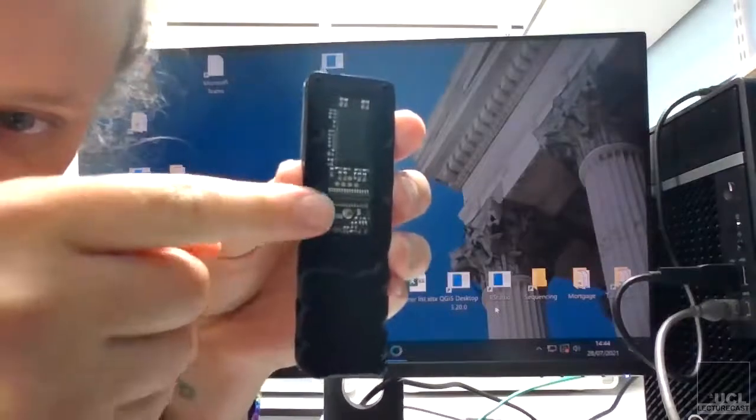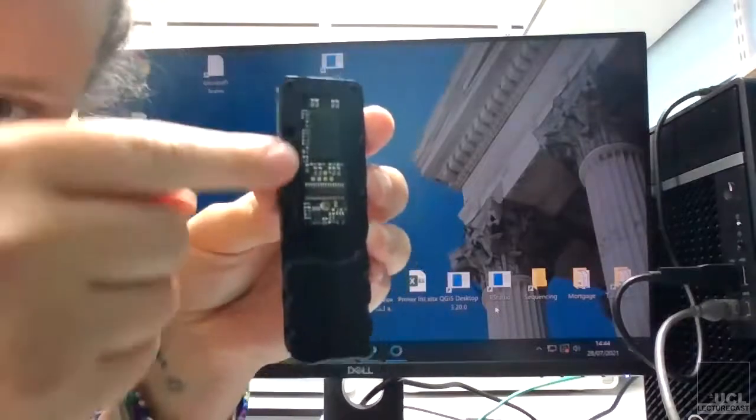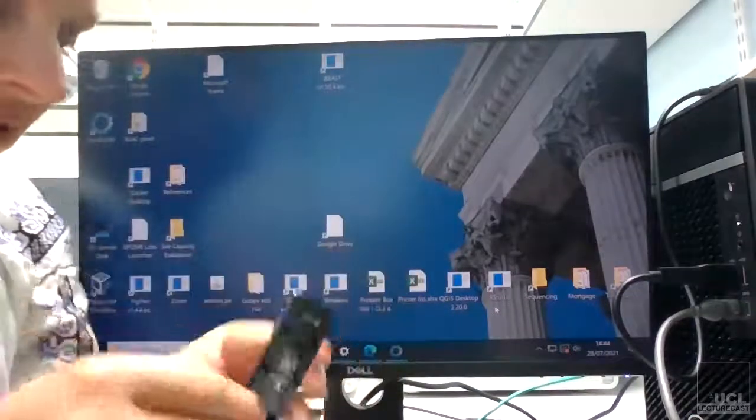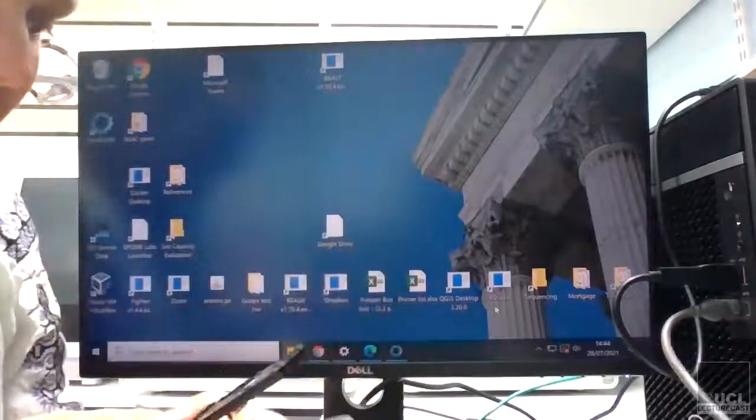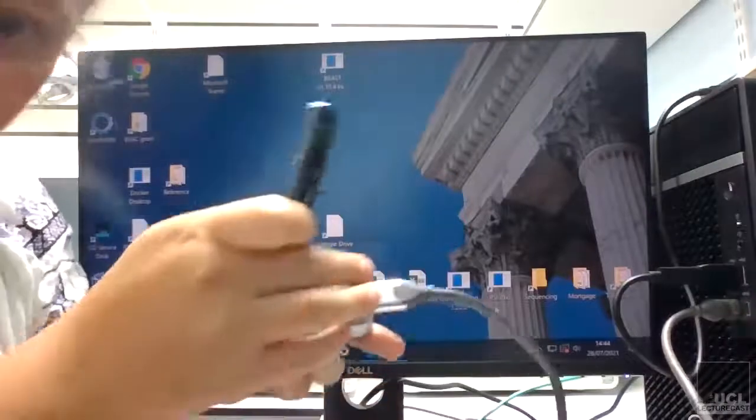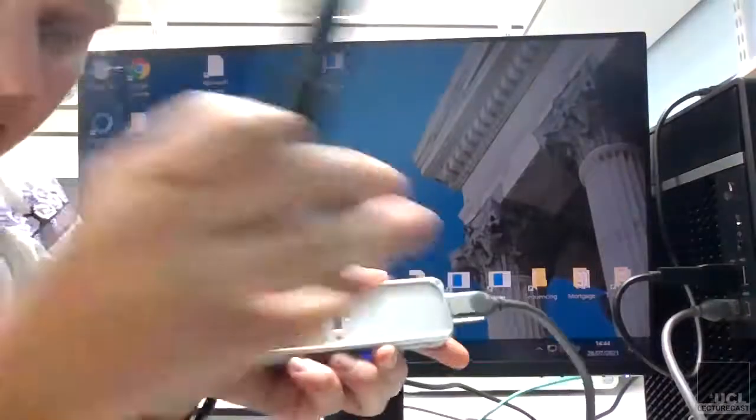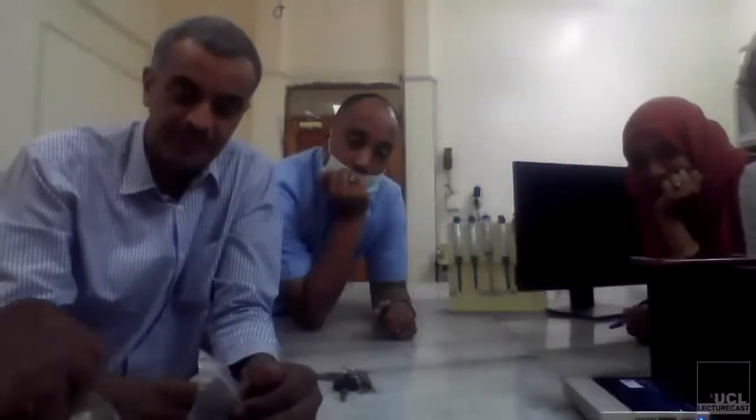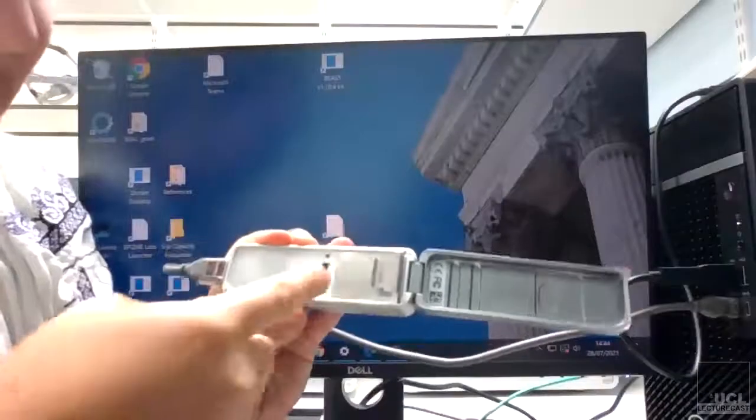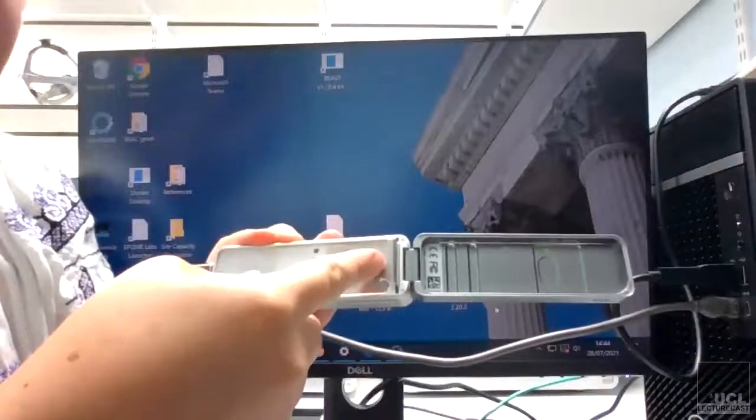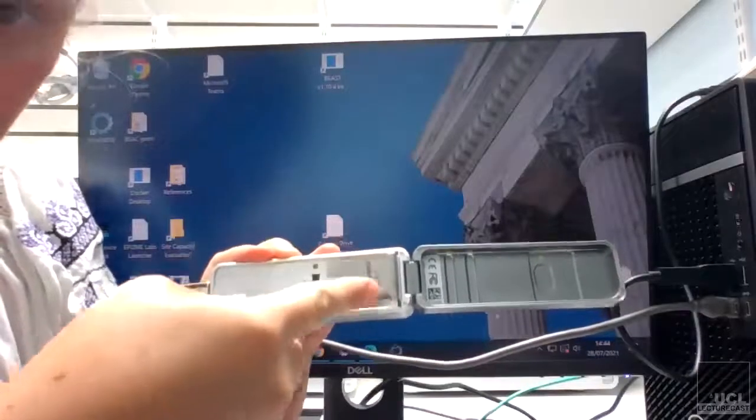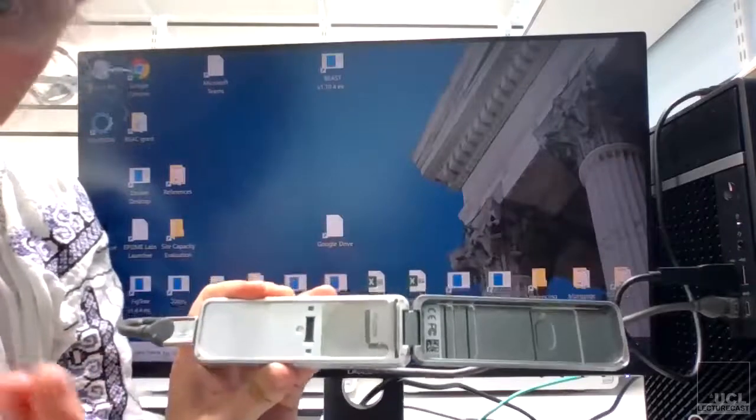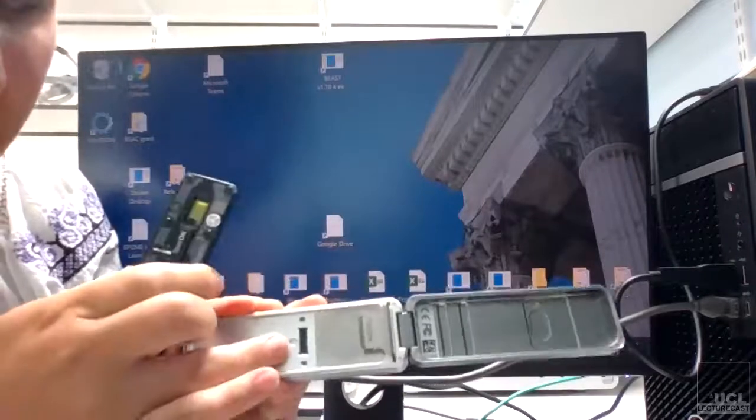This is the end that when you have a look in your MinION section, that way around, you can see that there's a clip, and the chip section goes into the clip.